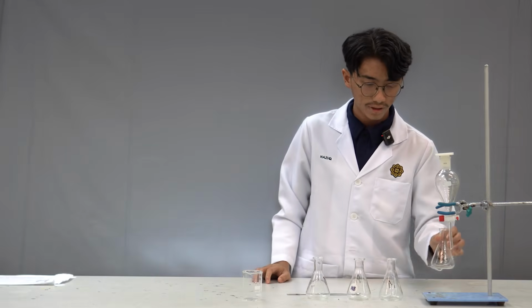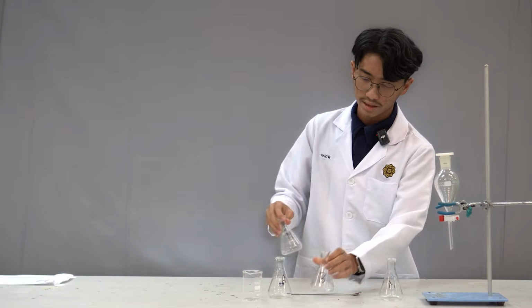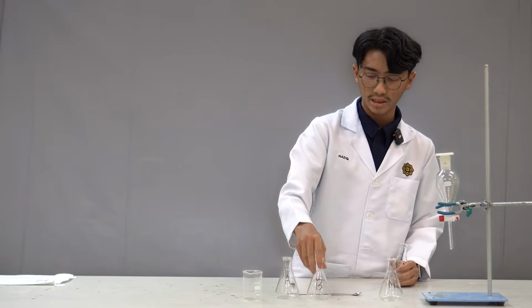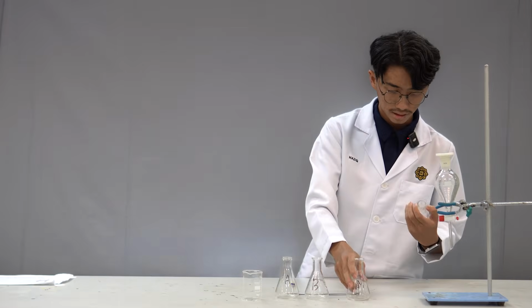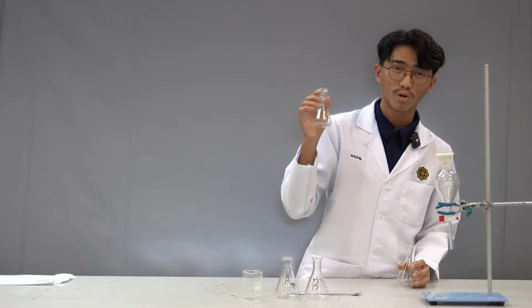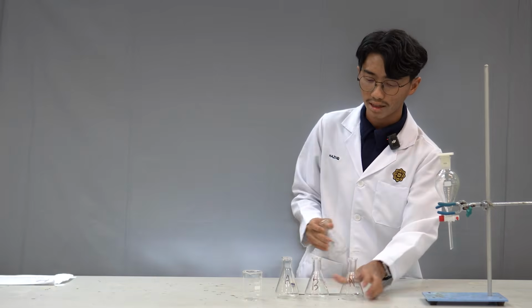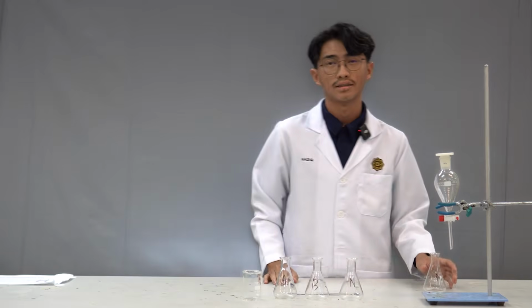After we finish that, we have the acid flask that contains pure acid, the base flask that contains pure base, and then the mixture flask. We can put what is left in the mixture flask into the neutral flask, and then we get 3 pure fractions: pure acid, pure base, and pure neutral.